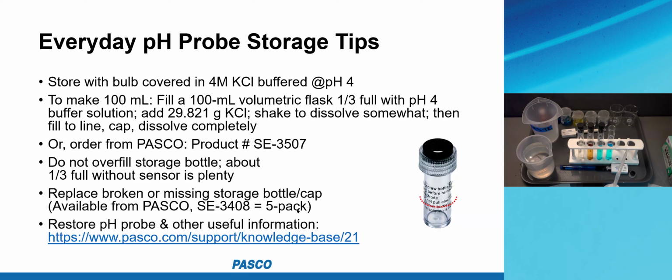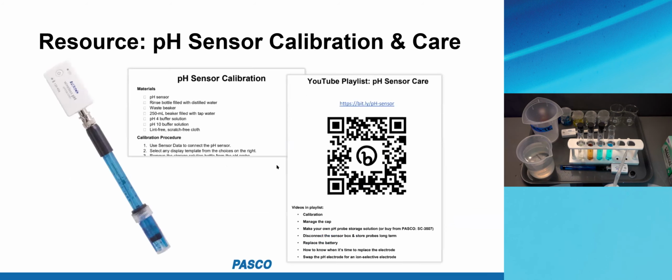All of this stuff is going to be hard to remember. So what I did, all of this stuff here, I put the pH sensor calibration and care information at your fingertips on this slide in your resources folder. So go into your resources folder and find the playlist that has all the ways to take care of the pH sensor and also how to calibrate the sensor.